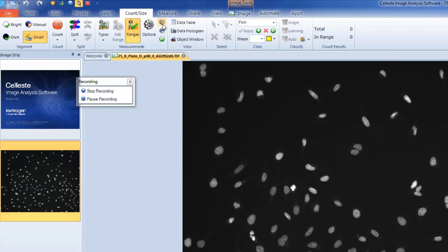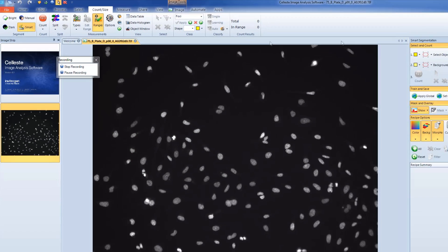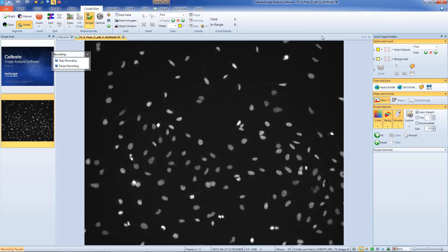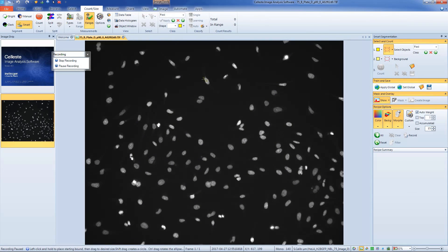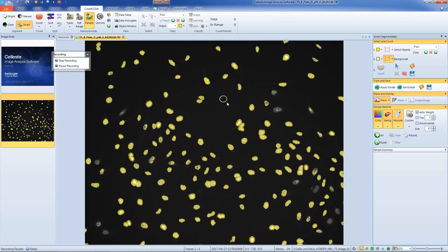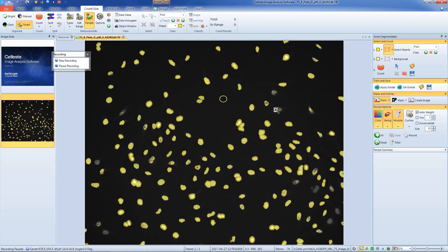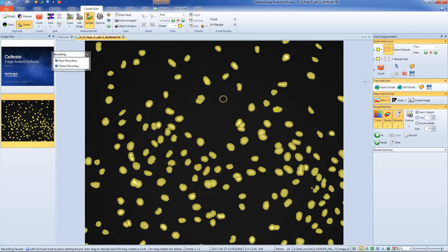The settings are now loaded. If we want to make the Smart Segmentation tool interactive so that the object and background can be selected for every image we analyze, click on the Smart Segmentation button in the Segment group. If you'd like the Object Select step to remain the same for your macro, skip this step.